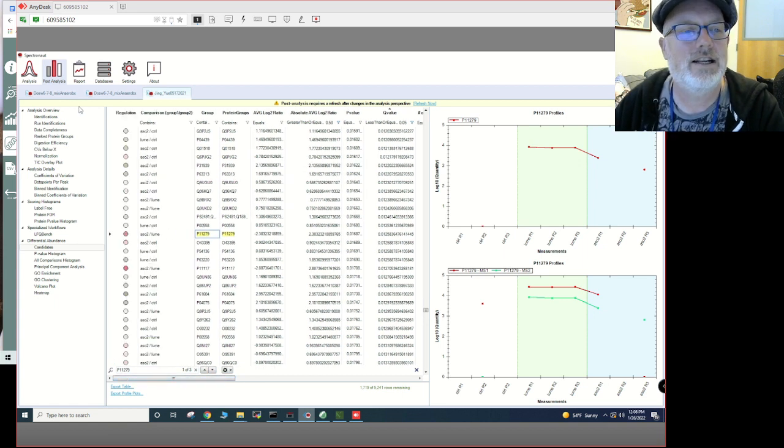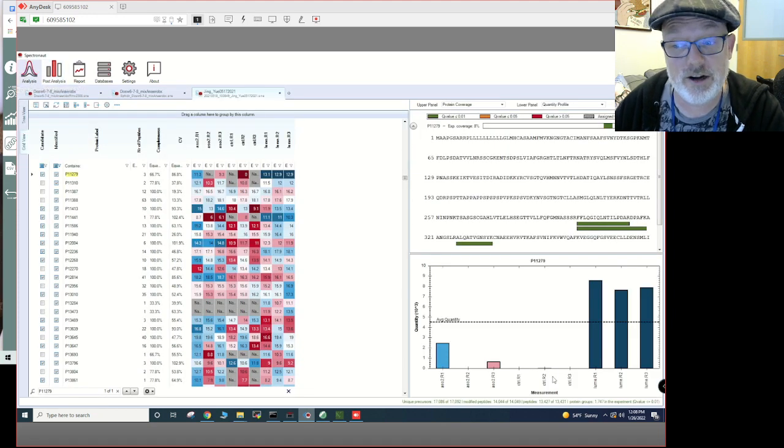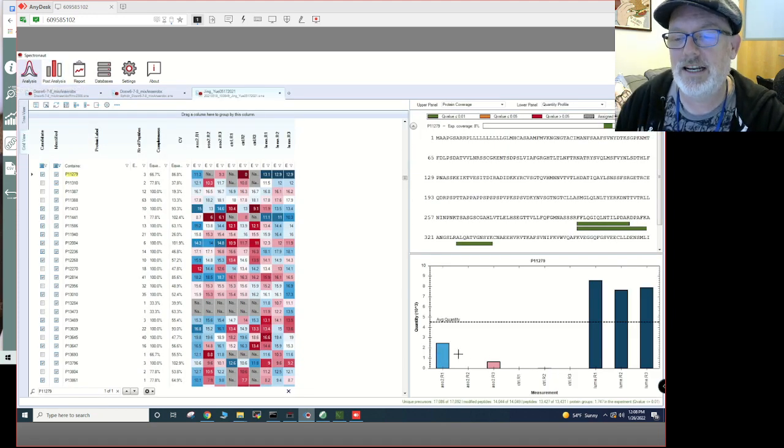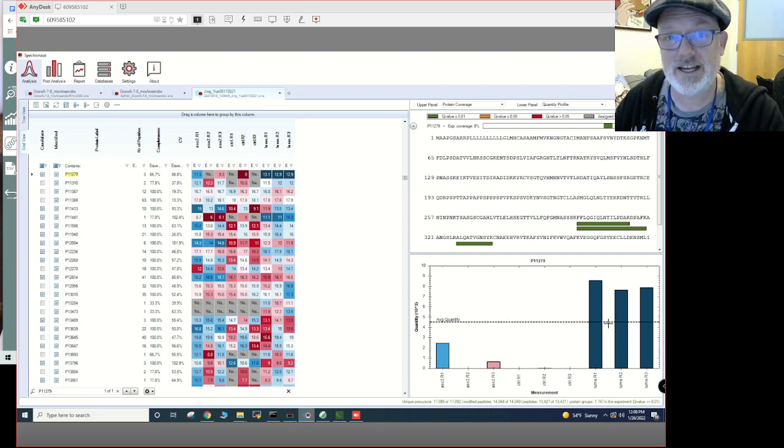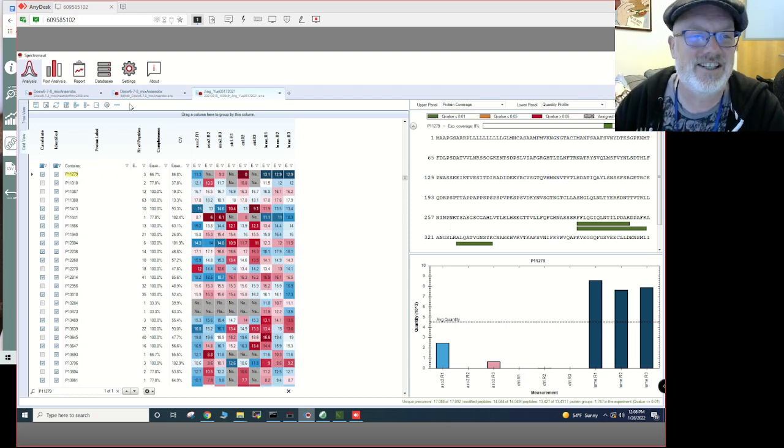So why is that? If we go back, my suspicion, I've already done this, so I know. My suspicion is that the t-tests have trouble with missing values, and there's kind of a sporadic signal here, which we know is not true. It's kind of background. So because of all the missing values and the little signals here, it's not showing as differentially expressed using the t-test that Spectronaut does, even though your eyeballs clearly look at it and you're like, duh, it really is differentially expressed.